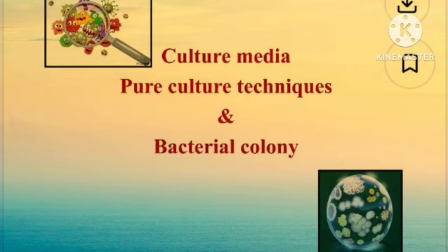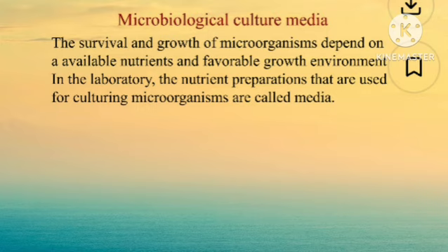And the next slides are pure culture techniques. Pure culture technique means single colonies are isolated. In microbiology, culture media for pure culture techniques are very important. The survival and growth of microorganisms depend on available nutrients and a favorable growth environment. The nutrient preparations used for culturing microorganisms are called media.